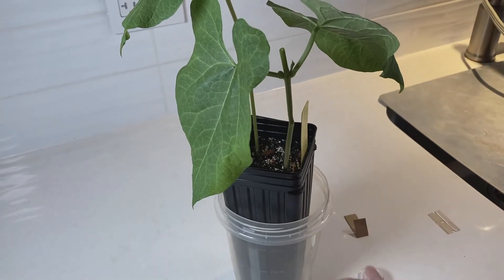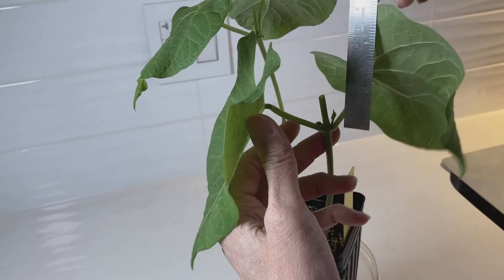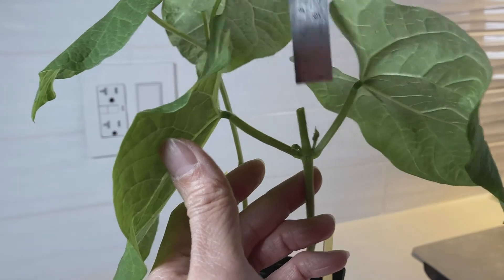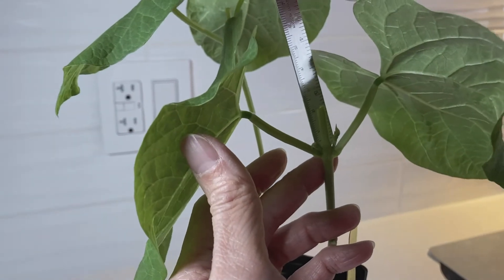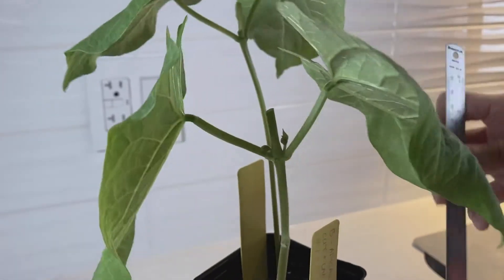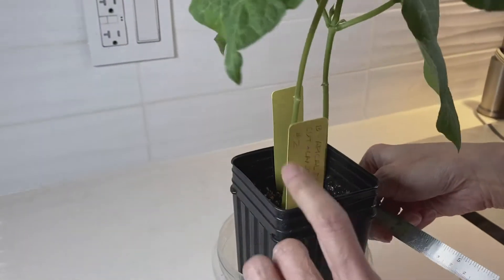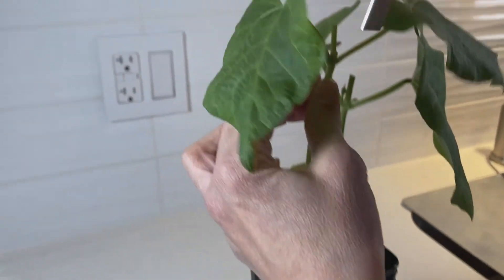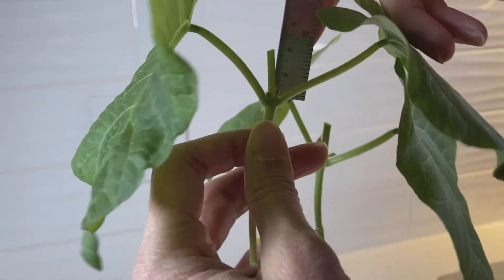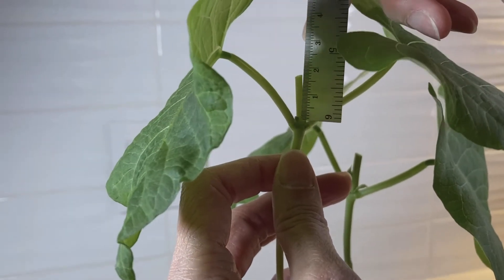Before you go any further, take your ruler — you'll have to supply your own because there isn't one in the kit — and measure the length of your lateral buds. Measure one and then the second one; there will be two for each plant. Make sure when you record this in your chart that you know which plant it came from, number one or number two. This one has much smaller lateral buds, so carefully don't damage them.